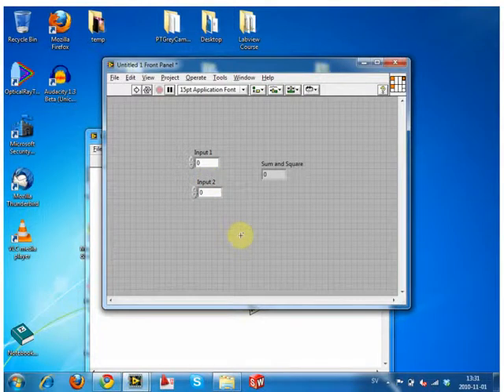How do we do it? What would you like to do? Like to have this orange thing. So click kind of close to it, and then you can just drag it. Left click in one of those, and then left click on there. There you go, that's connected. To move it, left click somewhere in it and just drag it. Now just left click inside this square. Nice.